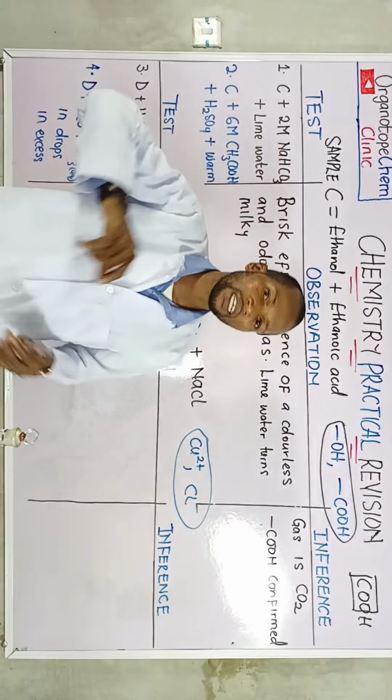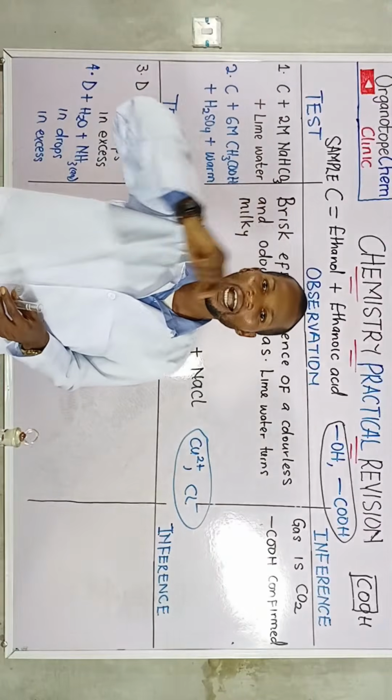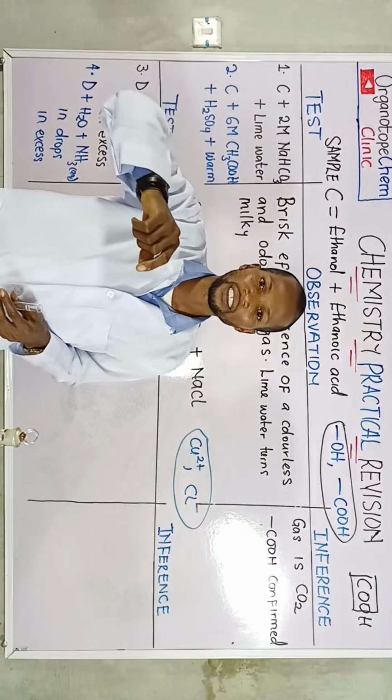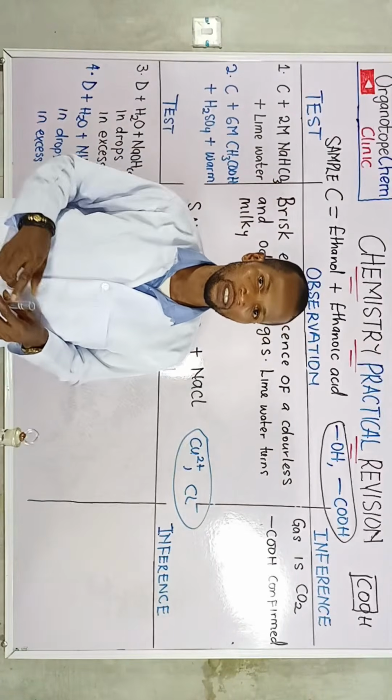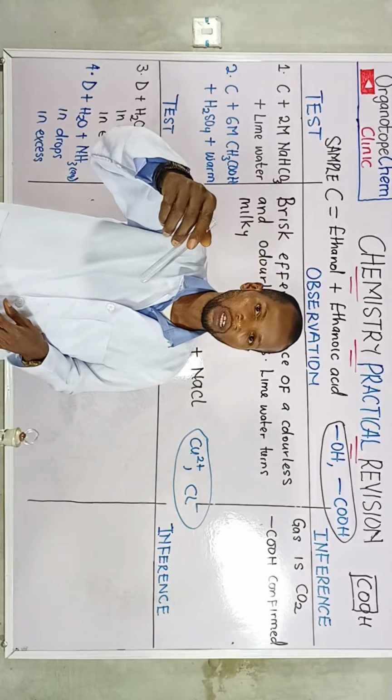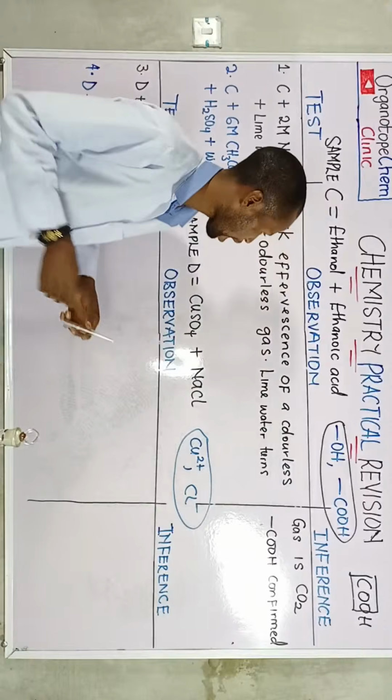But if a water bath is not provided, I will teach you how to warm such that it won't be a direct heating of the mixture. So avoid direct heating of the mixture, okay? So can we have our mixture?